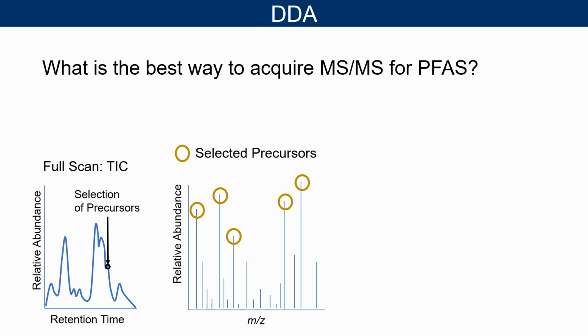So if they're not very different in polarity or size, and they have the same mass, or if they have very similar masses within plus or minus 0.5 Daltons or less, we will co-isolate and fragment them simultaneously, because while our measurement happens at plus or minus 0.005 Daltons, the isolation actually happens at plus or minus 0.5 Daltons. That's just something to be aware of: a fragmentation spectrum might belong to more than one molecule, which can confuse the issue.